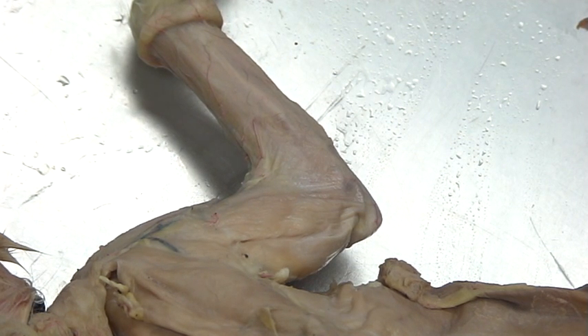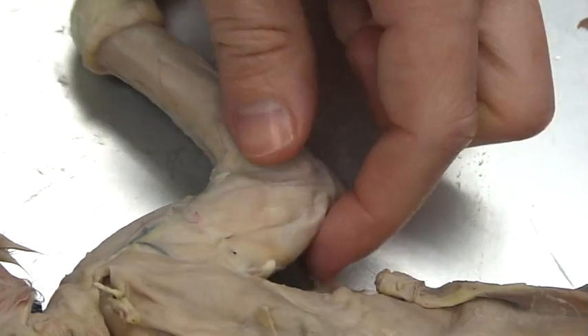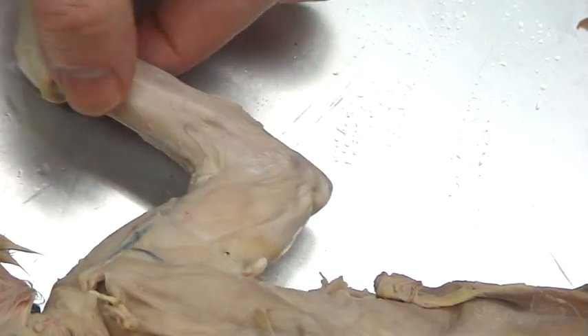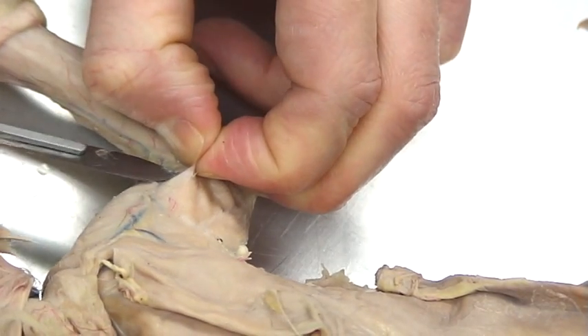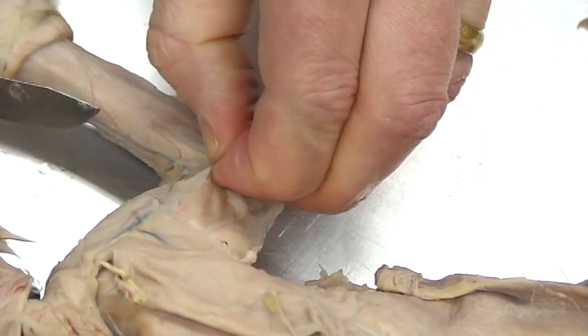Now for one of the trickier types of dissections — not tough, but there are a couple tricky spots. What we're going to do is take a look at the upper arm muscles, the humeral muscles as well as the radial and ulnar muscles. To do that, you're going to want to cut away a lot of this fascia and separate out all the arm muscles.